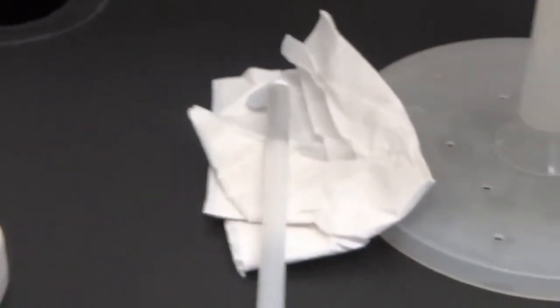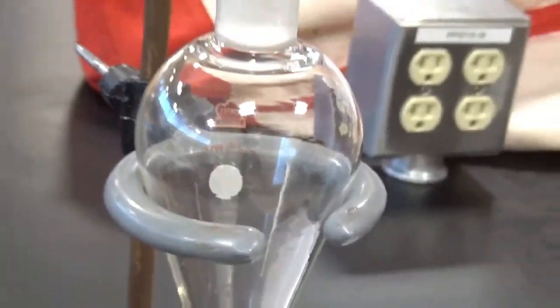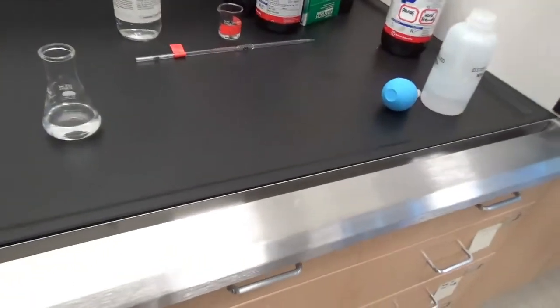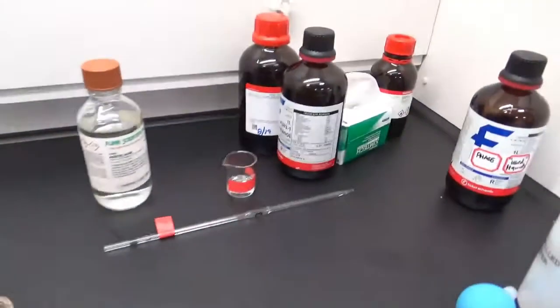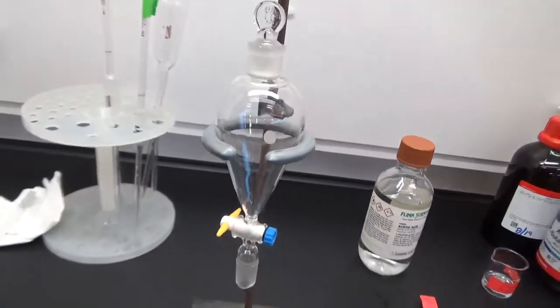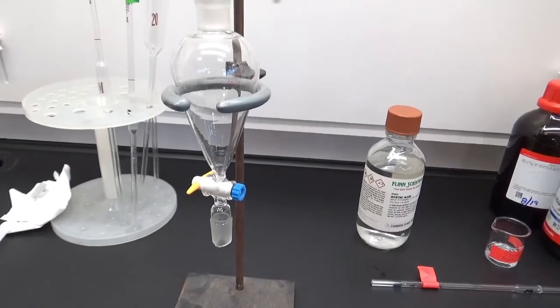Okay, now, so here's my mixture, and it has the acetic acid in it. What I'm going to do, as you can see here, this is a separatory funnel. I'm going to pour this into the sep funnel, and then I'm going to separate the two layers. I'm going to put the lower layer in the beaker for the lower layer, and then I'll weigh it, and the upper layer in the beaker for the upper layer.